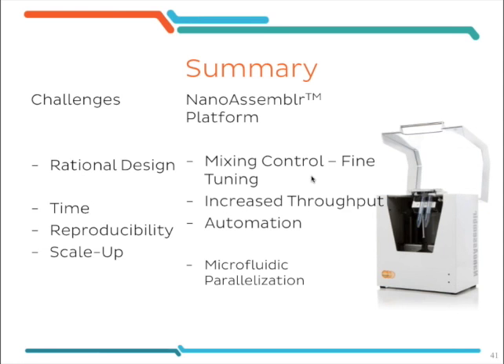And by using the microfluidics and just putting microfluidic channels in parallel and doing this nanoprecipitation in this parallelized system, we can seamlessly scale up our nanoparticle formulation that we first made at a small scale with a benchtop instrument.